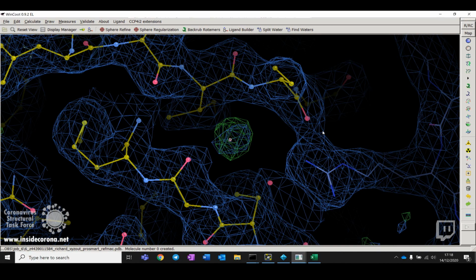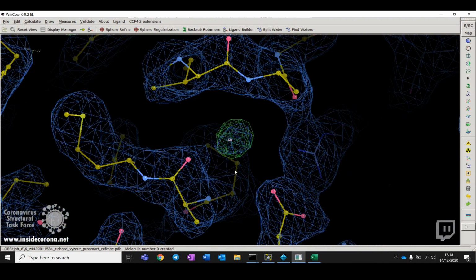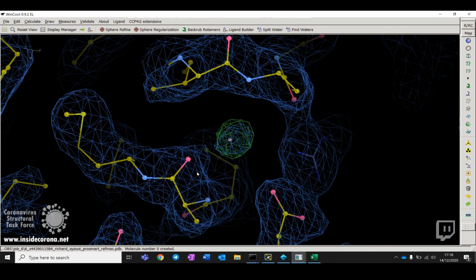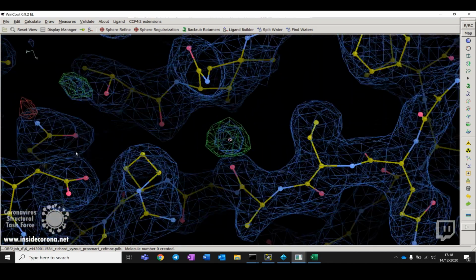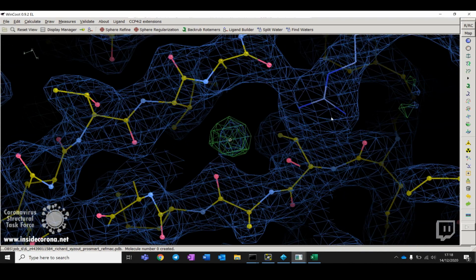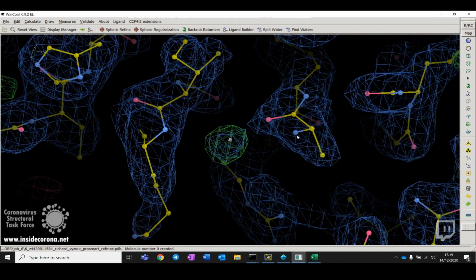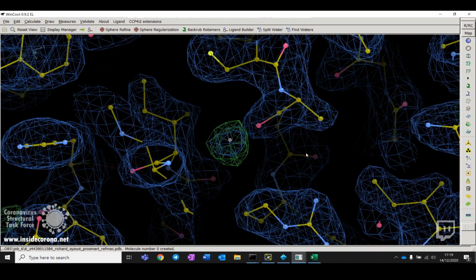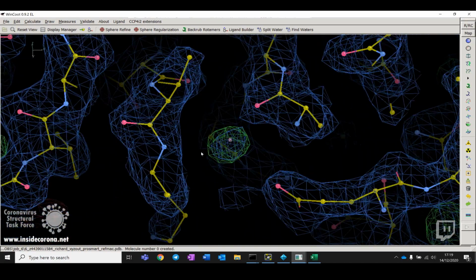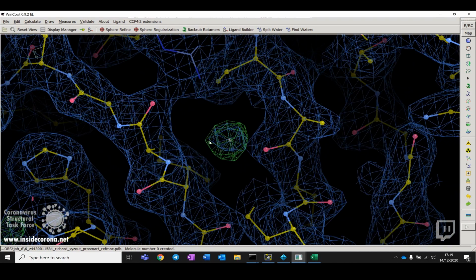Most of our protein crystals are in fact mostly water, or mostly solvent. So not the type of crystal you would think about when you think of, say, a diamond or a ruby or a sapphire. These are much more fragile and easily broken, because they are mostly water, and they can also dry out and just fall apart. So the crystals are very pretty, but not quite as hardy as what most people would think of when they think of a crystal.